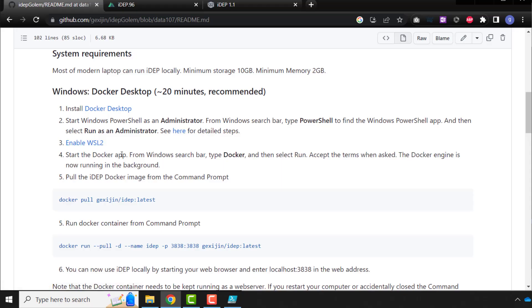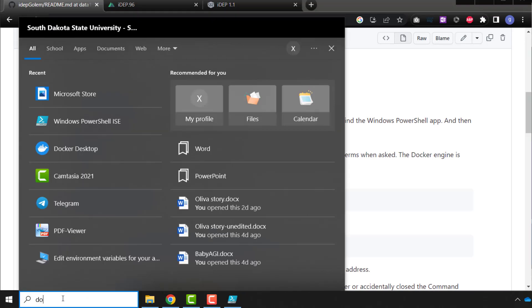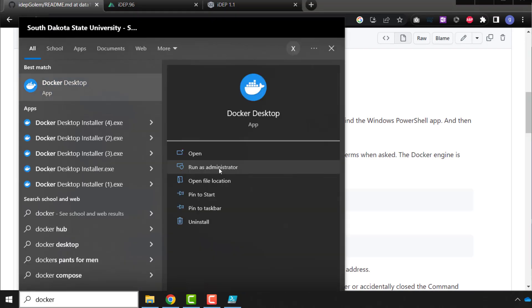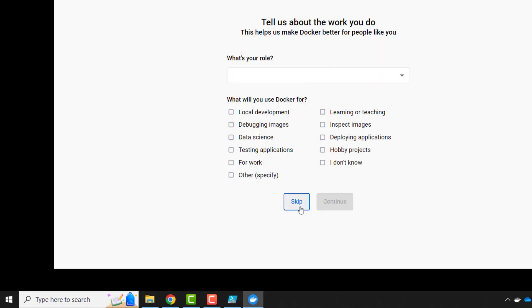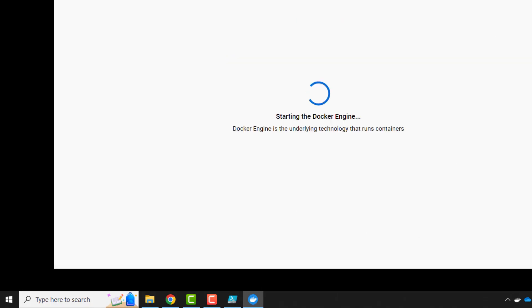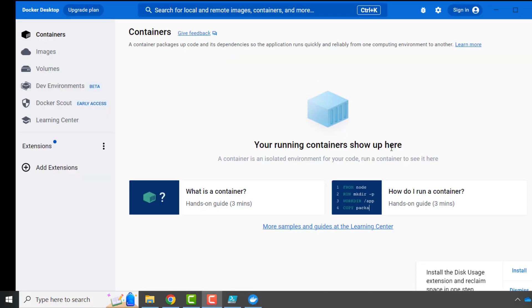So we want to say Docker, run as administrator, the first time, it asks for permission, accept. And skip this, the container is running.